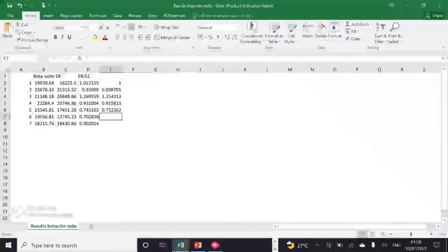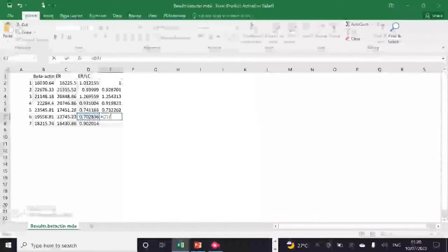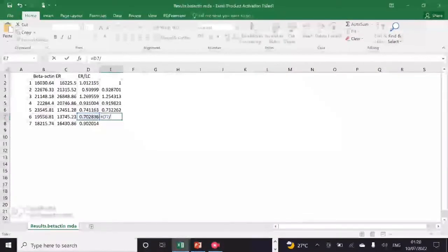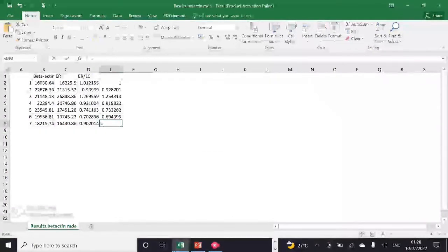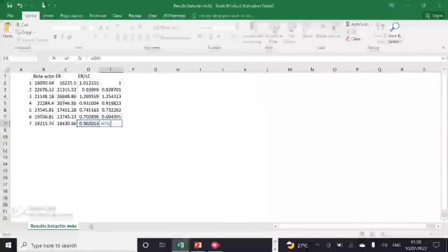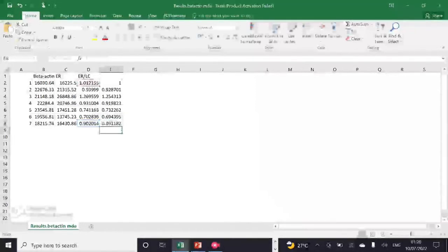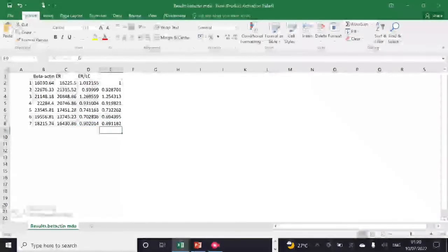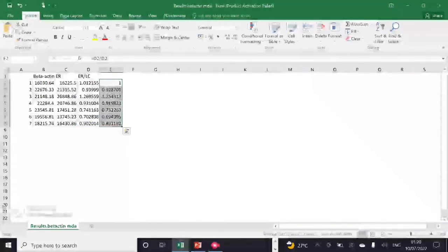After that, I will analyze which of my treatment groups are having higher ER protein expression. From my data, it can be seen that my third treatment group is having the highest ER protein expression, which is 1.25.